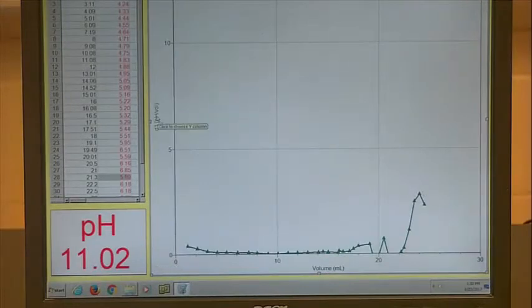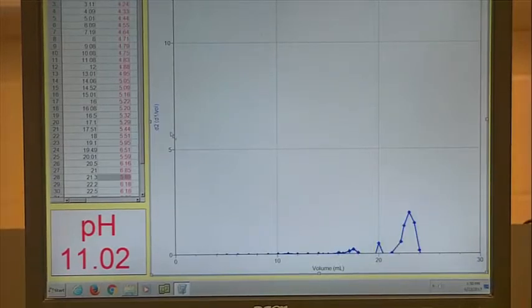And then we will left click here and go on D2. And D2 is where it crosses the x-axis. So for that, you want to click on your 0 and maybe change your axis to minus 10.